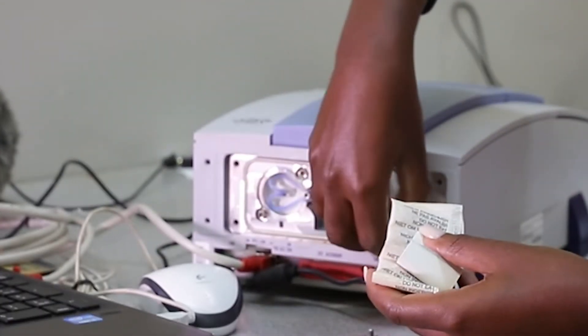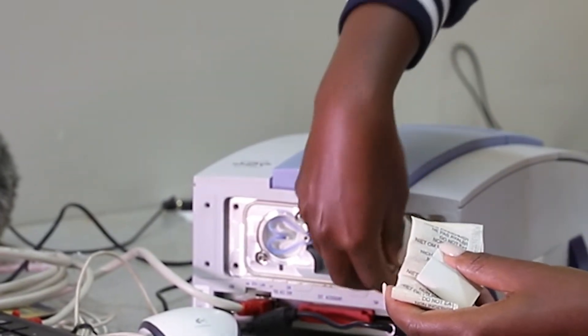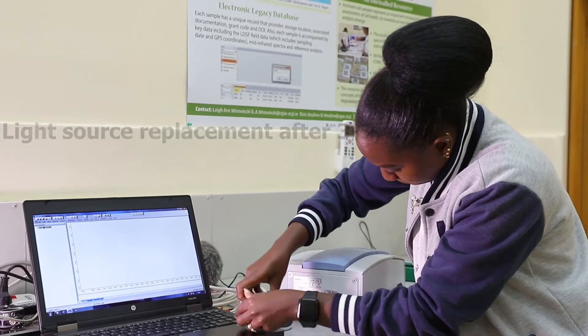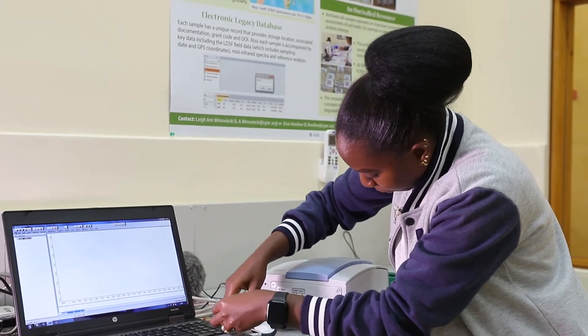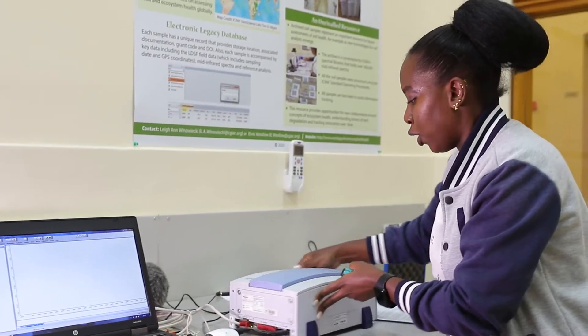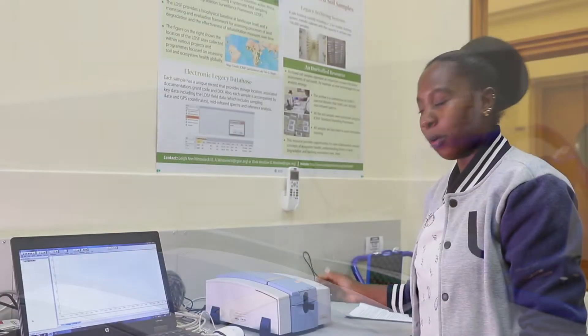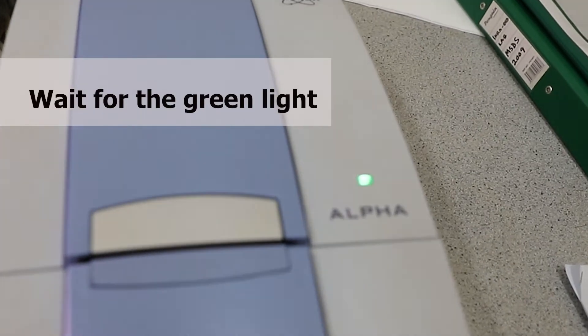We also have our light source here, which we are supposed to replace every five years. You tilt back the instrument and you have to wait for around 30 minutes where the instrument is going to turn green.